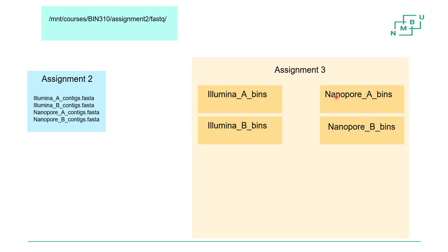So now you should have one contigs file in each of these 4 folders. And they are not copies from here because they are smaller, right? You throw away all the short contigs now, those shorter than 1000 bases. So the FASTA files you get in here should be much smaller actually than this here. Yeah, perhaps not so much smaller in memory because you throw away only short contigs and they are not so big.